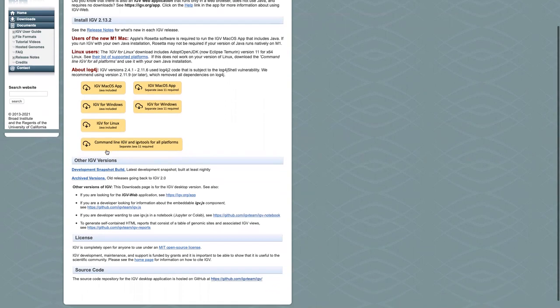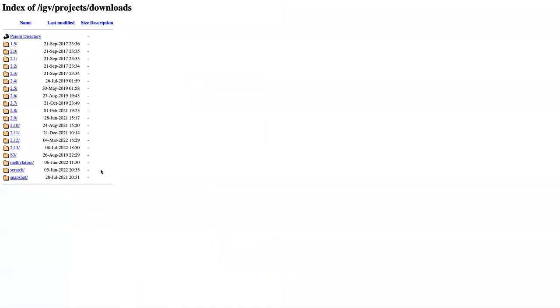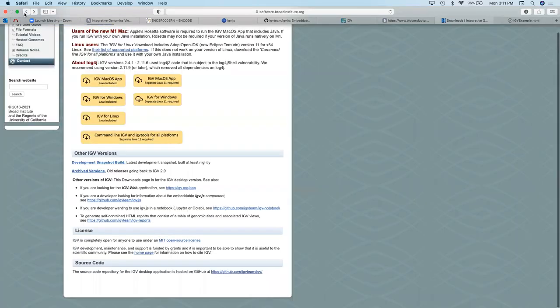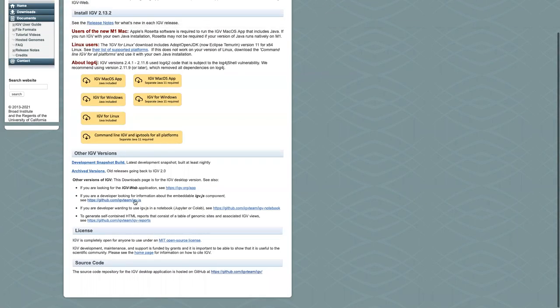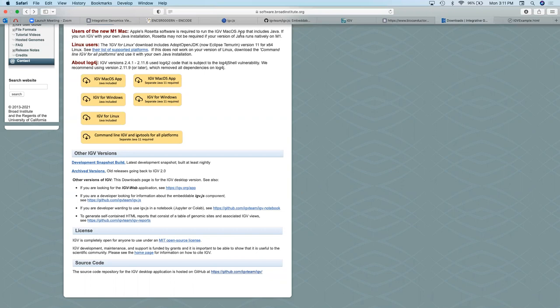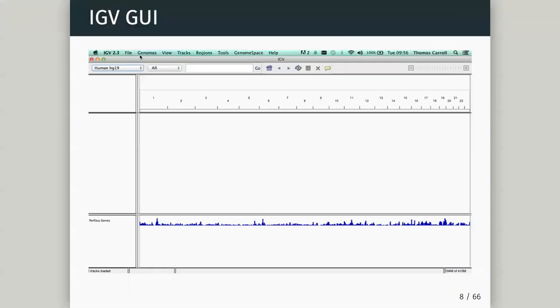If you want archived versions - which can be important when data isn't displaying the way you like or configuration has changed - there are archived versions available. You can also see they're moving development to IGV.js, the web app version. Once you've got IGV, double-click to launch and you have this IGV GUI.